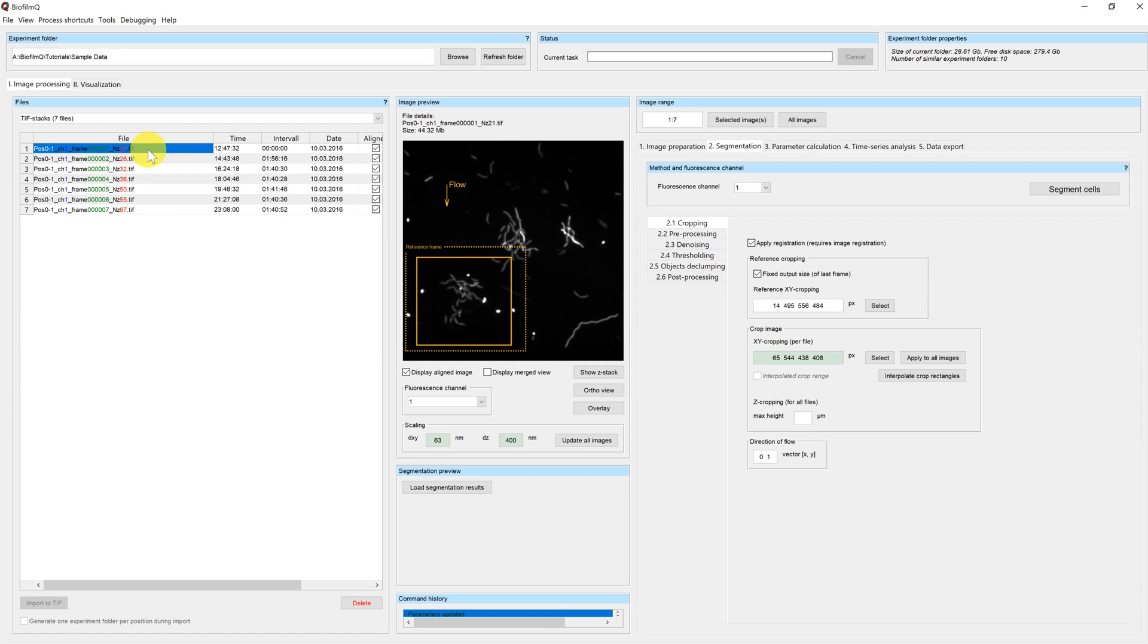Or if you have a growing biofilm like in our example, you can also interpolate the crop rectangles. That means that the frame will be adjusted to the biofilm size. I will show you how that works.